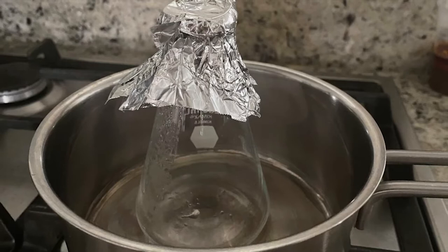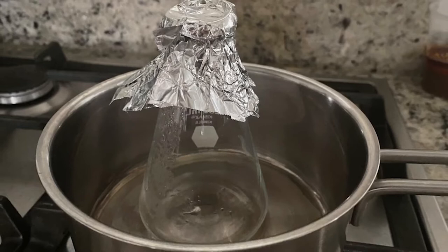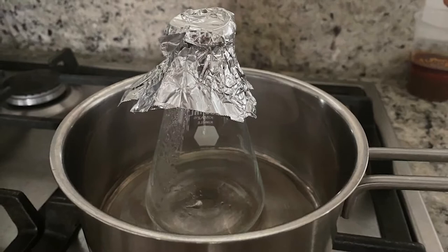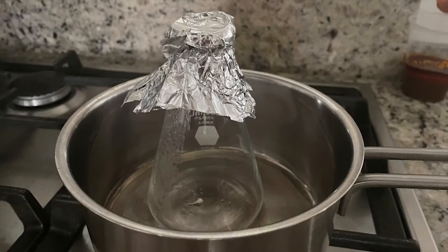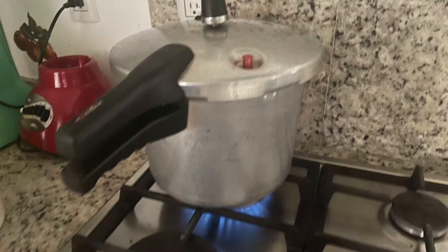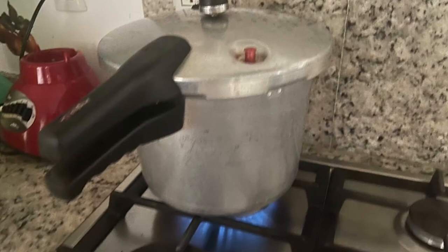The MS medium and agar provided by the professor were used. These were prepared for a final volume of 50 milliliters. MS was added first and stirred until completely dissolved. Then, agar was added and heated until uniform. It was left to stand 5 minutes and poured into 3 small glass jars. After this, the lids were put on and placed in the pressure cooker to be sterilized together with the tweezers.